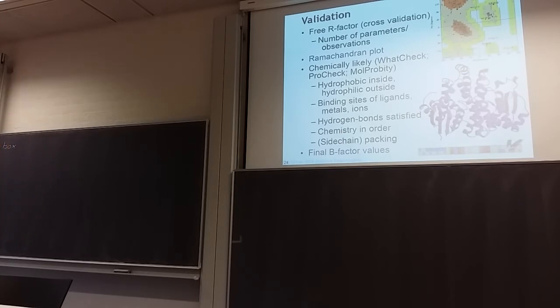So you look at things like side chain packing. If you have a phenylalanine buried inside the protein, there's quite some typical contacts that it usually makes. So you can look at whether your phenylalanines in your new structure actually make similar contacts, or whether they're too close or too far away, or with the wrong type of atoms and so on.